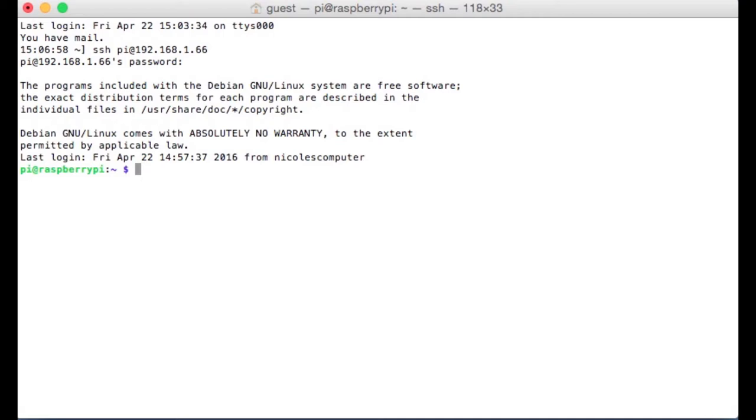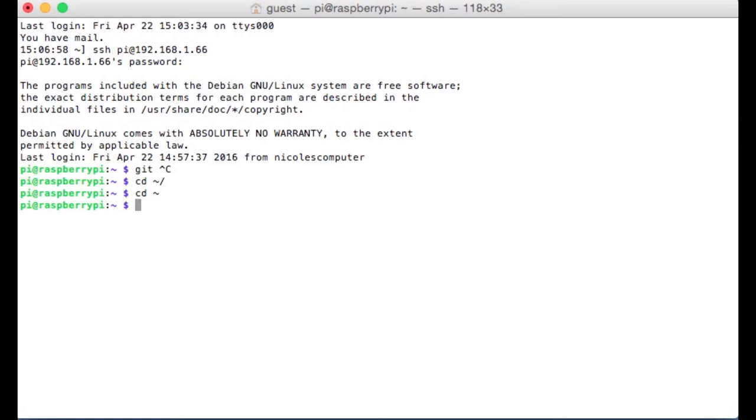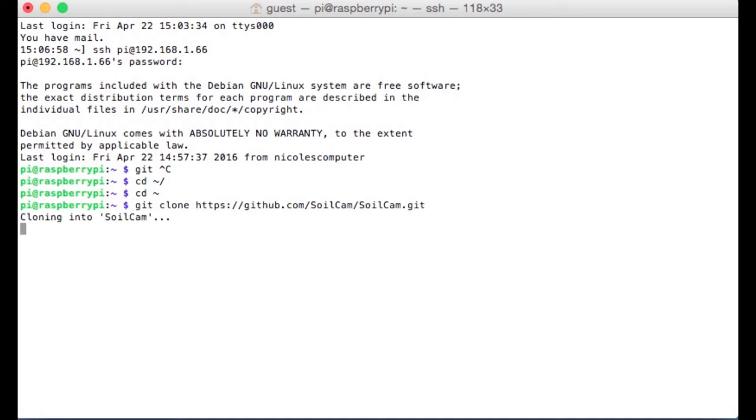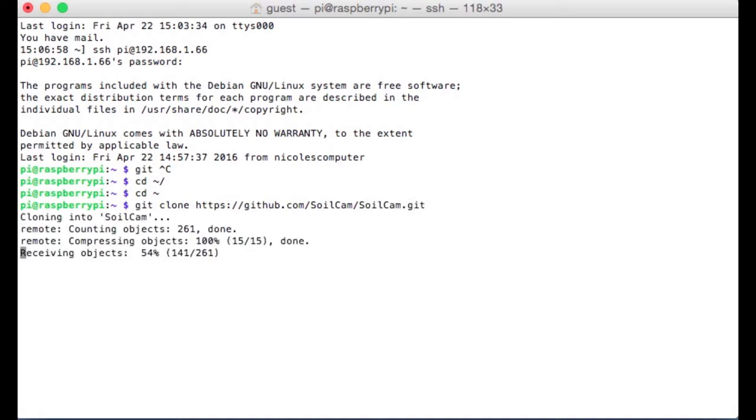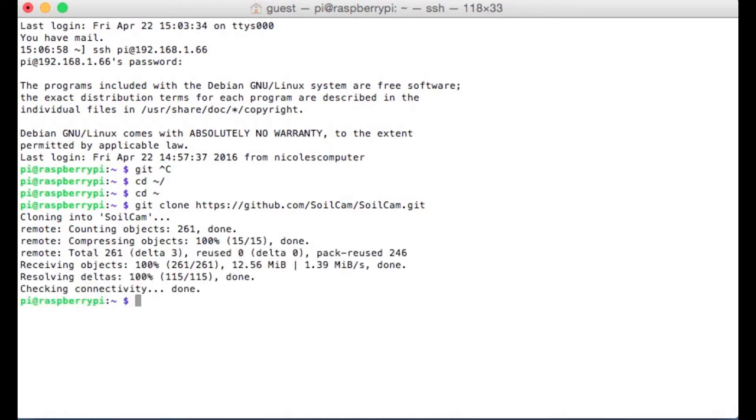We need one more script that's going to make it easier for the scanning software to communicate with the image editing software, to then talk with some video processing software, so that ideally we can be more hands-off. I'm going to use some software called Git to do that. Before that, you should make sure you're in your home directory. So type cd space tilde, and then type git clone https://github.com/soilcam/soilcam.git and hit enter.